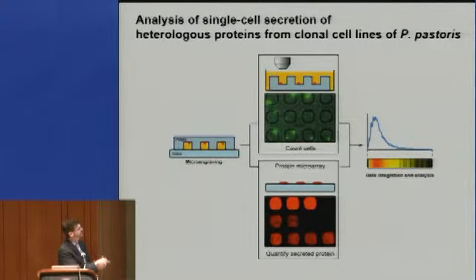We get the protein microarray, which we can then look at the rates of secretion for individual cells. We can map that back by image cytometry. In this case, we're counting cells, but we can also look at the average age of the cells. We can follow them dynamically and look at how they bud. A number of different elements that I'm not going to have time to talk about today. But just to point out that we can, in fact, make quite detailed measurements in cytometry about how those cells are behaving and link them back directly to secretion.